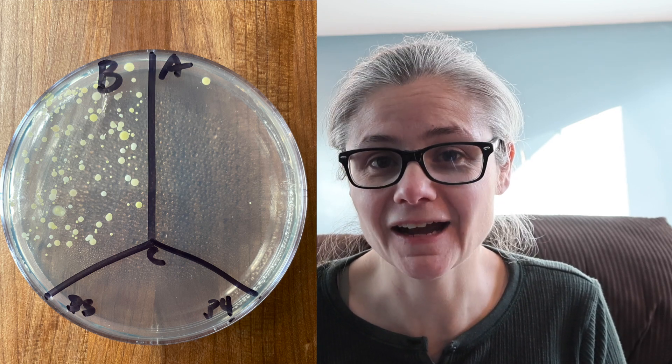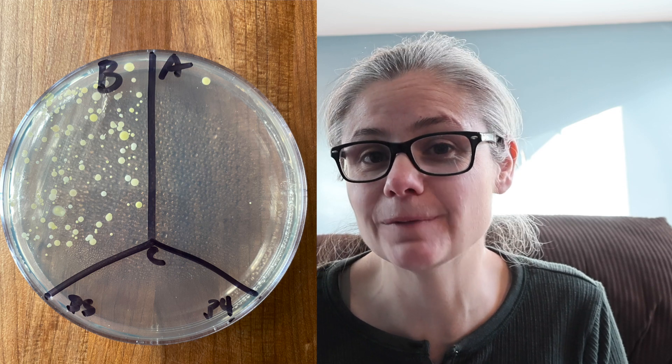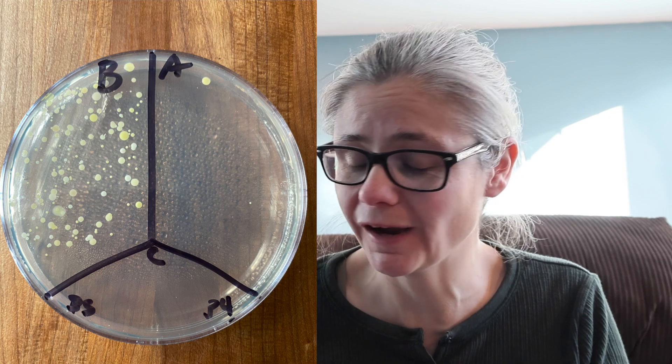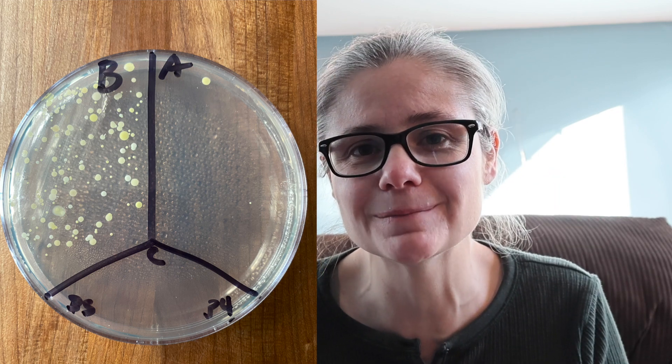The bathroom sink: in the before section you can see a lot of bacteria, and I like this sample because you can see different types of bacteria as well. In the after section, there are three tiny bacterial colonies. So again, the bleach — just spraying, wiping, rinsing right away, not waiting six minutes — did a really good job at removing bacteria from my bathroom sink.